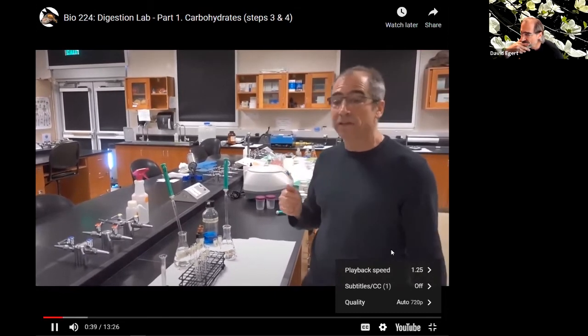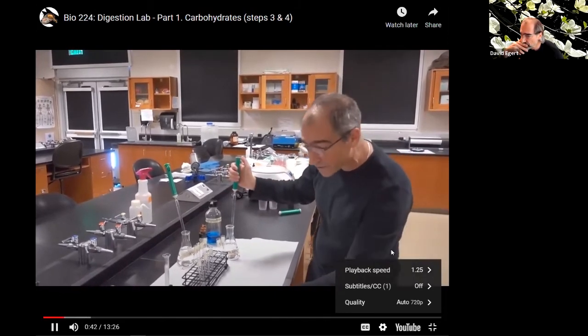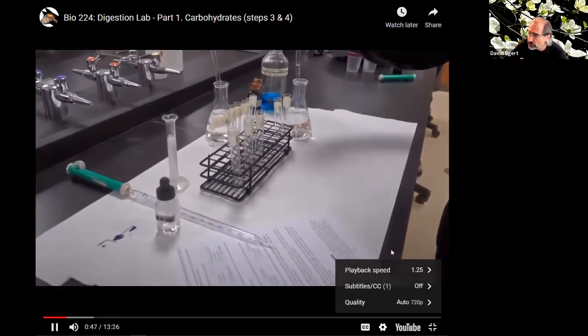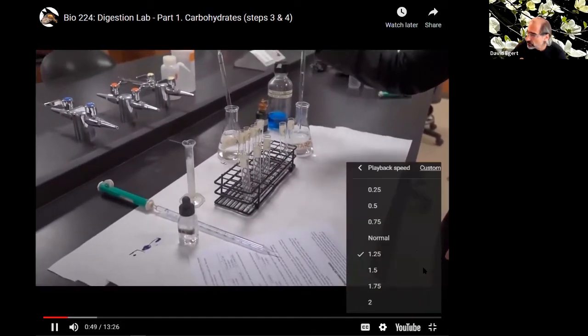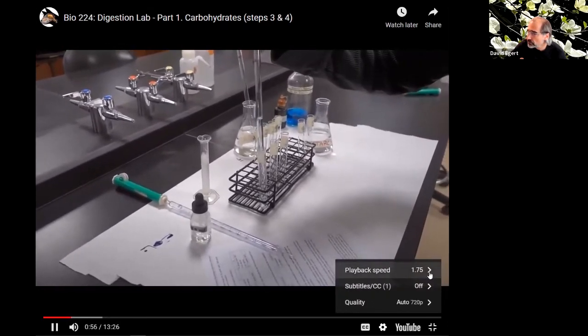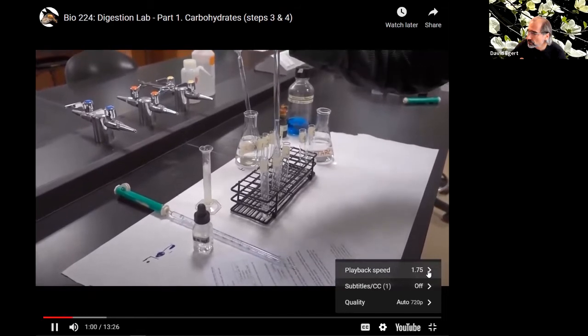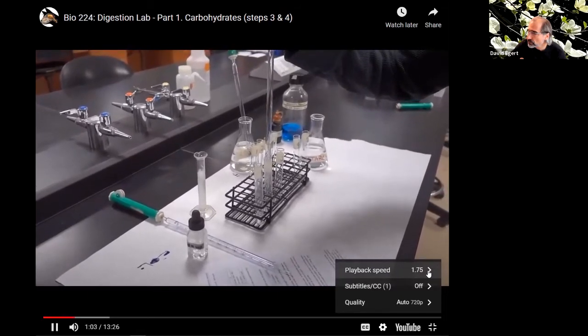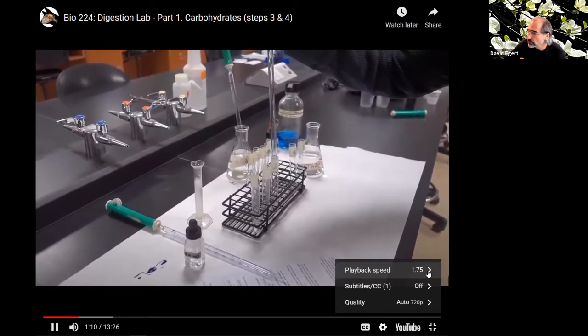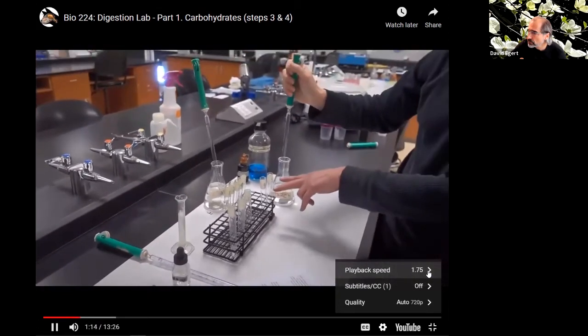To start, we're going to put some starch. We have 3 mL of starch that we put into each of these 3 tubes. I'm just going to put this up here. There's 3 mL in there, 3 mL in there, 3 mL in there. And then also 4 and 5 are going to be controls.